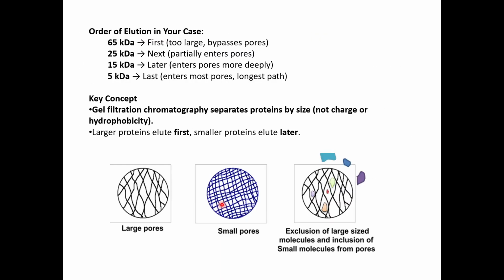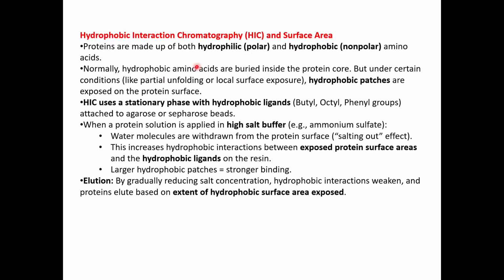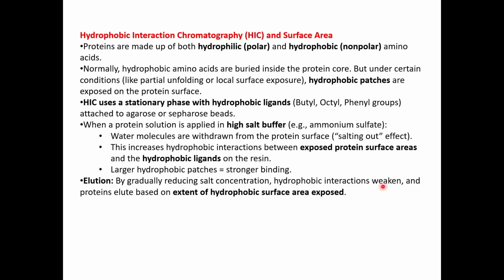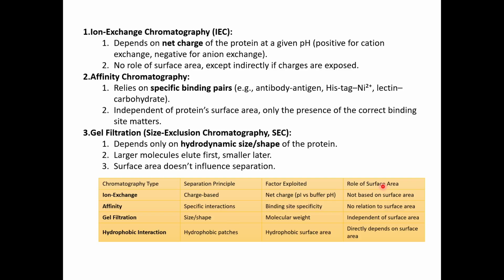So it's just a comparison, like how different it is from gel filtration, because gel filtration does not depend on any hydrophobicity. Hydrophobicity will come in case of HIC, which we had previously discussed.